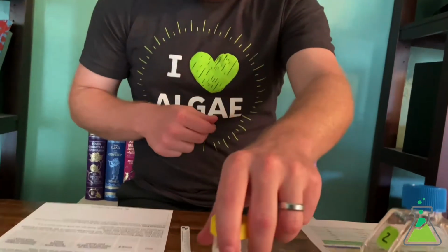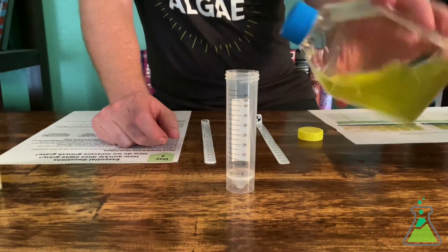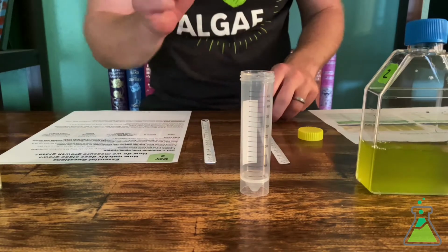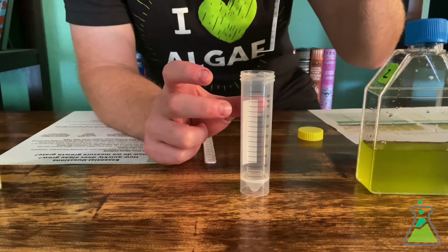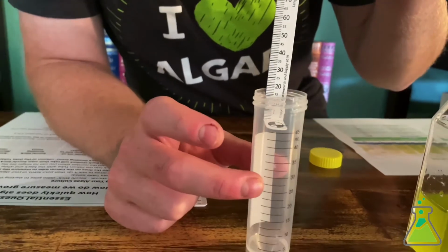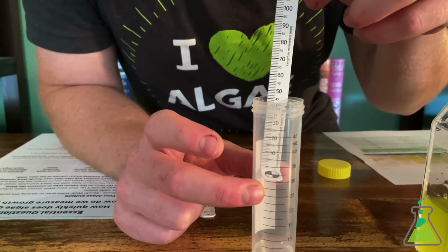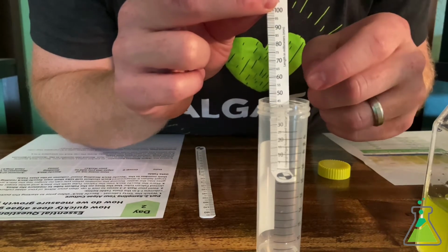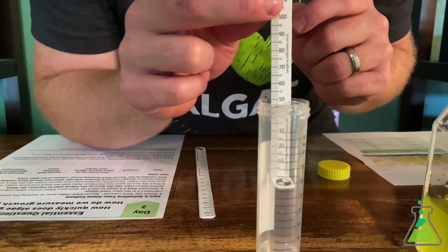And so let's do a quick dry run here. So normally we would shake up the culture and we'd pour 50 milliliters into the falcon tube and come all the way up to the top there. And then we'll use our Secchi stick and come right through the top of the falcon tube and lower the Secchi stick all the way through until the point where we can no longer see the shield, and we'll stop. And then we'll take a reading exactly where the water is contacting the surface of the Secchi stick. And that's going to be our Secchi stick reading that we'll write down on our worksheet.